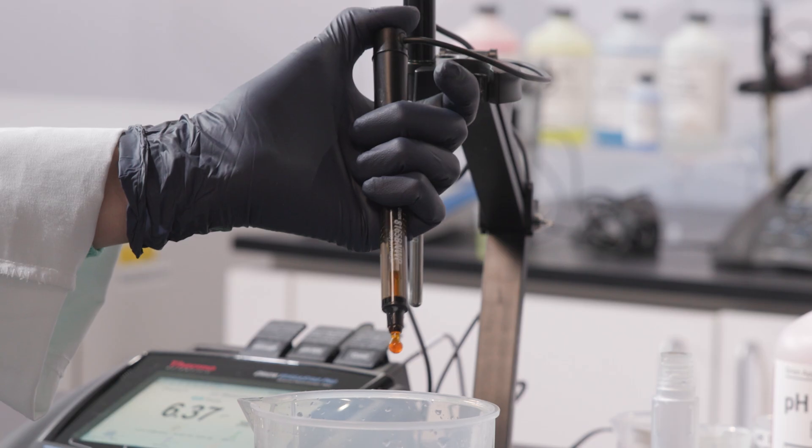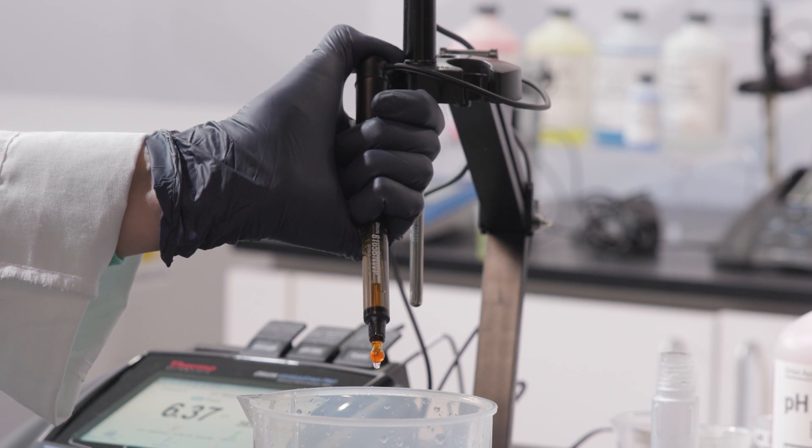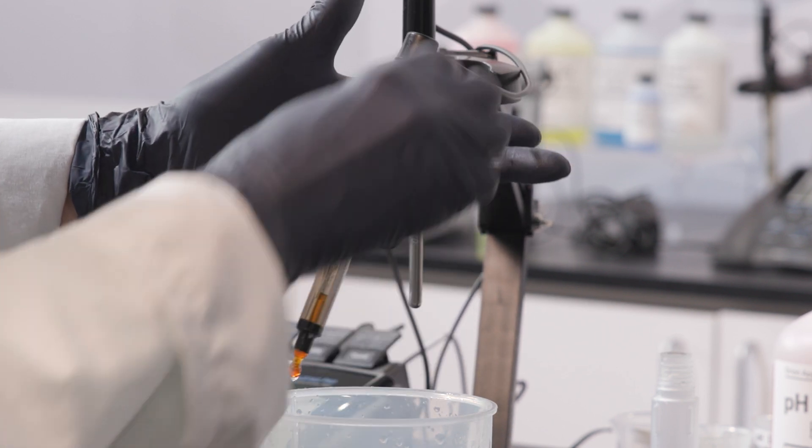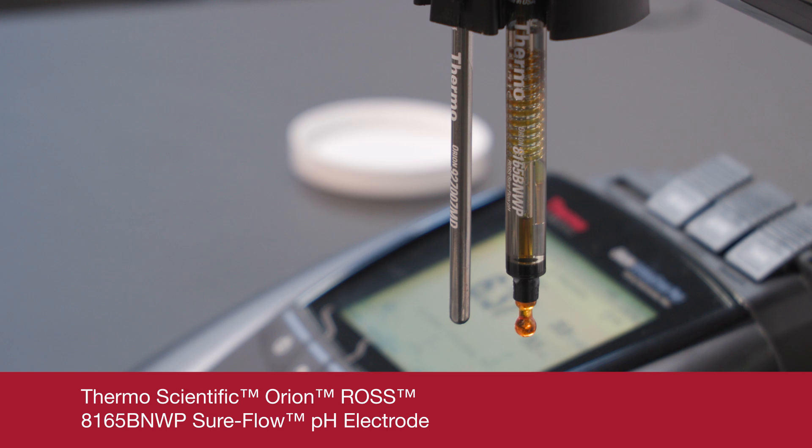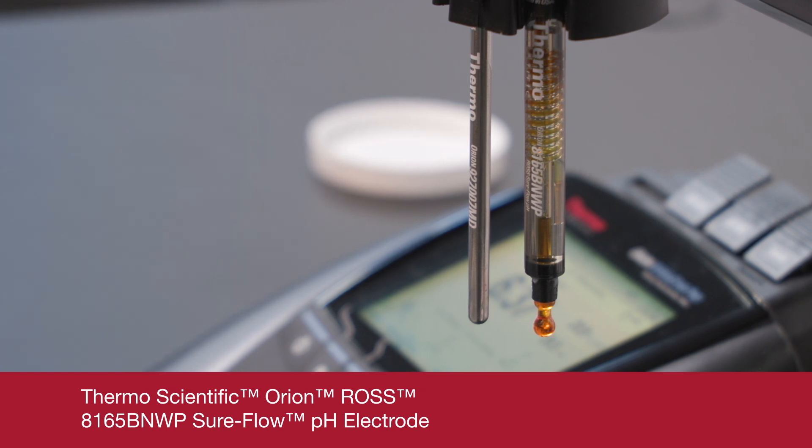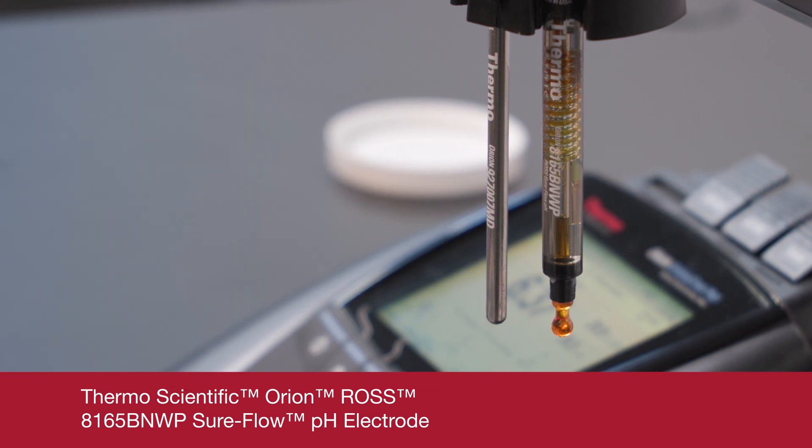Simply press down on the cap to refresh the junction or to drain and refill the electrode. Thermoscientific Orion-Ross Surflow pH electrodes have this very useful feature. Regardless of design, the more time you invest in cleaning and maintaining a pH electrode, the longer it will last.